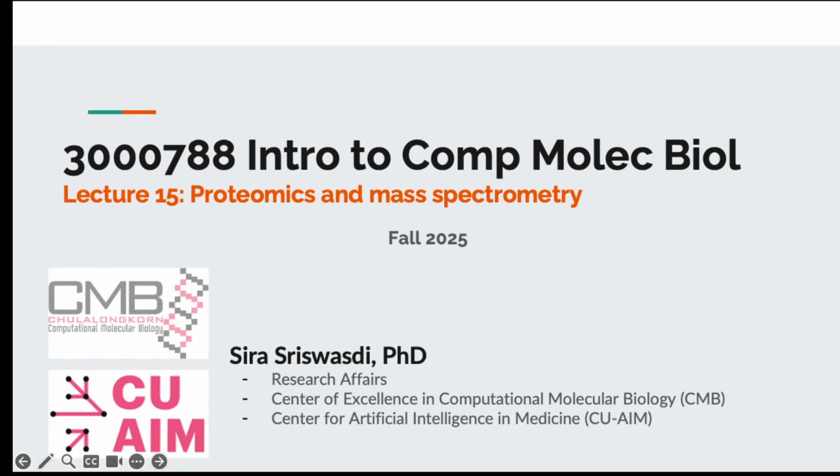Okay, so today is our 15th lecture. We finished the single cell analysis part, and now we are moving beyond transcriptomics into proteomics, the study of proteins. And we need a new tool. We no longer can use sequencing technology. Now we need to use mass spectrometry. So today we are going to cover these two topics: the study of protein and the mass spectrometry instrument.